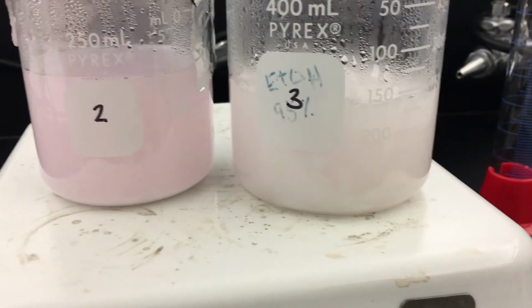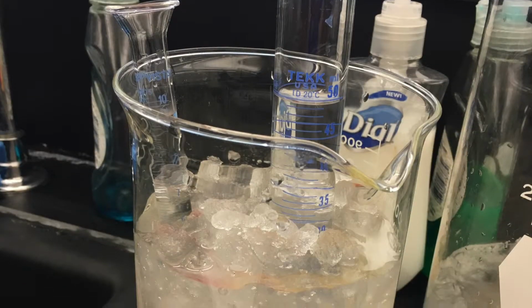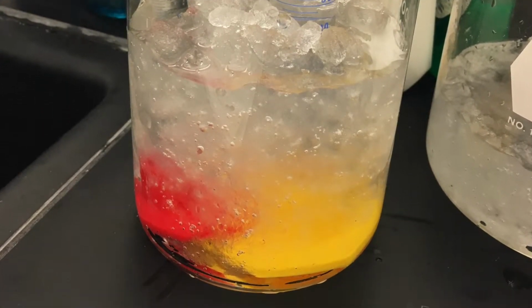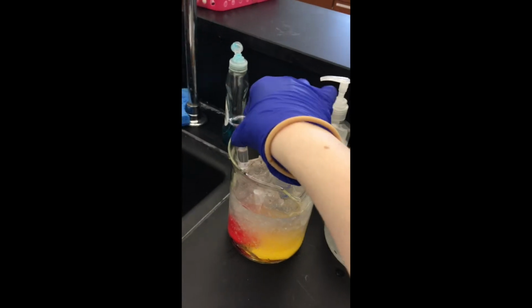At this point, your sample should be almost done boiling. Number 1 is an example of what your sample should look like after done boiling. Next, obtain some DI water and place in graduated cylinders in an ice bath for later use. After your samples are done boiling, place them in an ice bath and add about 3 milliliters of ice-cold DI water.